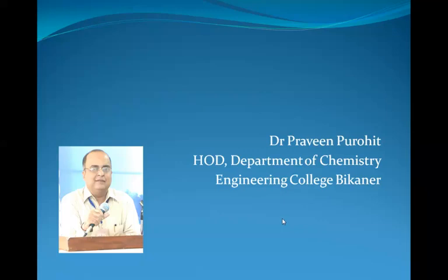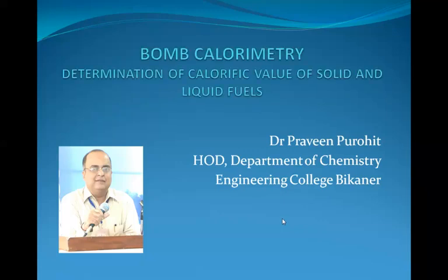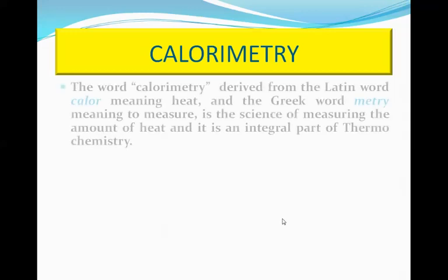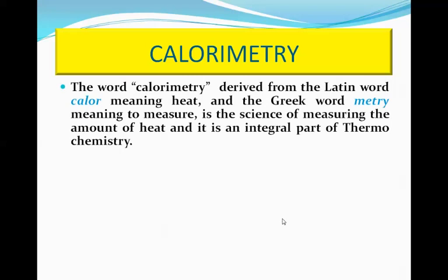Today, we will be discussing bomb calorimetry, that is, determination of calorific value of solid and liquid fuels. Calorimetry. Now, this name is familiar to each and every student of science, and calorimetry itself is derived from the Latin word calor, meaning heat, and the Greek word metry, meaning to measure. It is the science of measuring the amount of heat, and it is an integral part of thermochemistry.